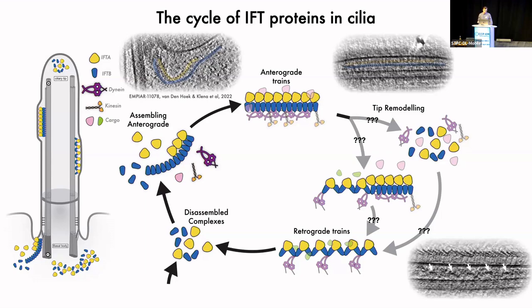So it's a really intriguing process where you have the exact same constituents, the IFTA and IFTB complexes, binding to different proteins, engaging in different interactions and forming these different structures, but we really don't understand the mechanistic processes allowing this to happen.